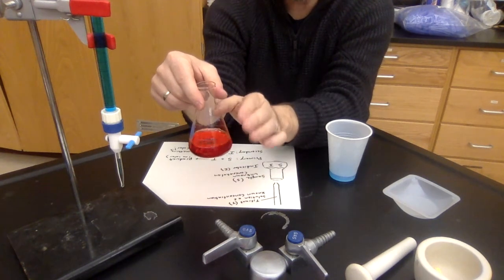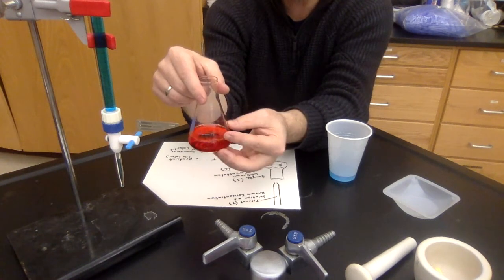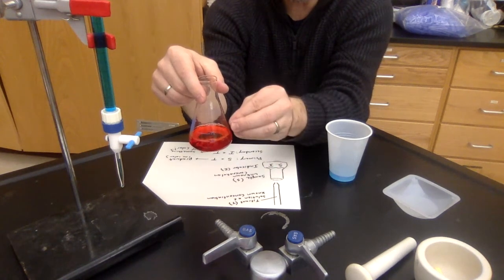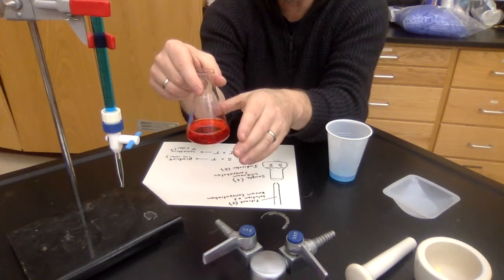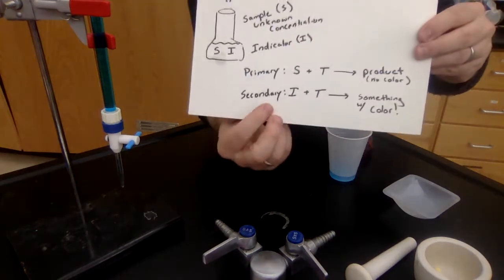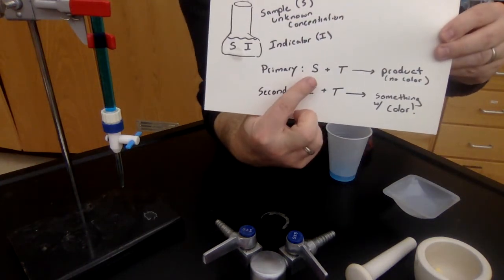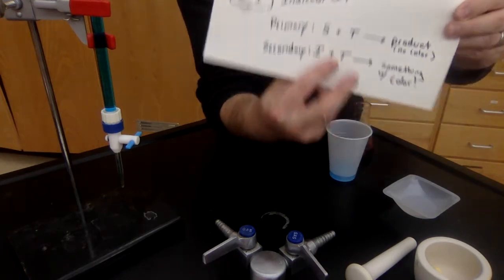If you think about the way that the titration works, you can always add DI water to your sample once you've put it in, and that doesn't change the number of moles of sample that are in there. So if we go back to this idea where I have a certain number of moles, parts of sample in there, just adding DI doesn't change anything.